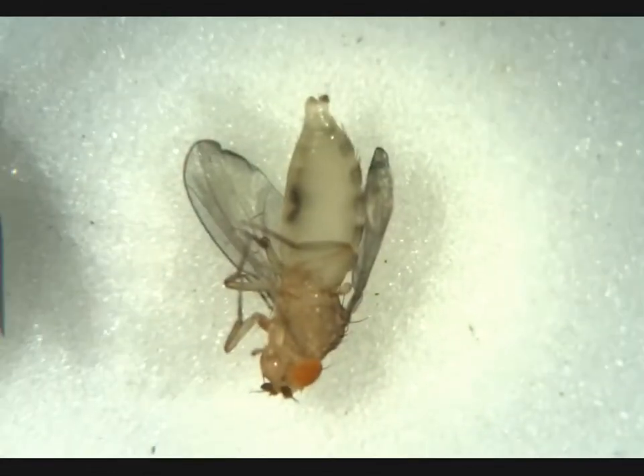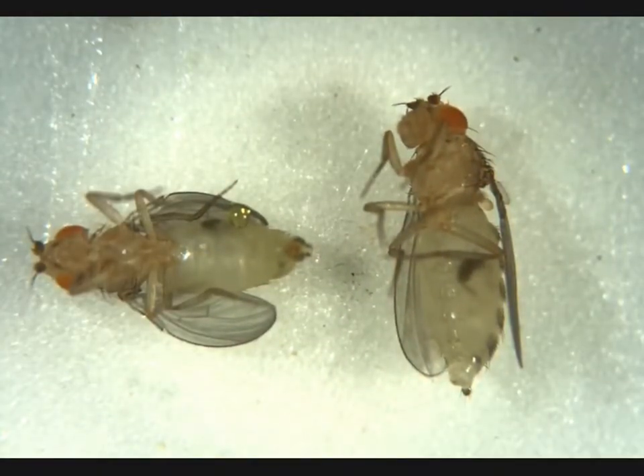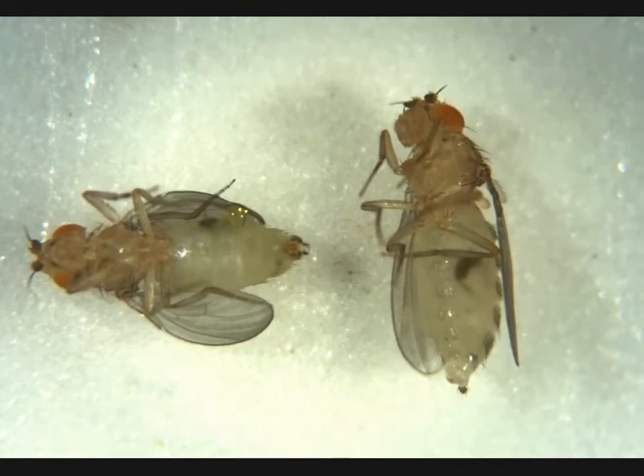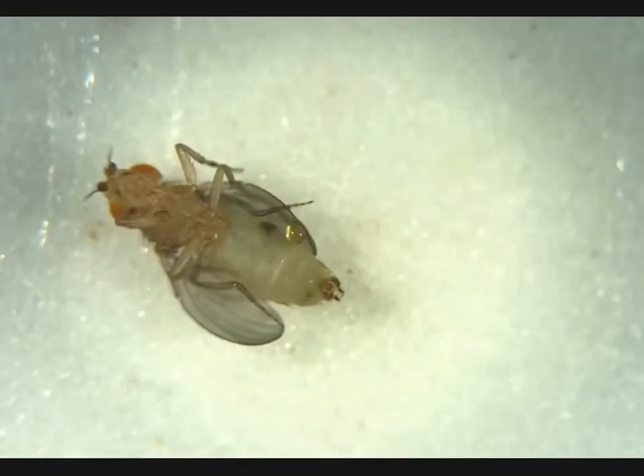And we have a virgin female here. We can tell — no penis apparatus, visible meconium. Another virgin female next to a virgin male. This is pretty exciting. We can see that the virgin male has a penis apparatus here, and we can also see no penis apparatus on this female. We can see a visible meconium on both of these flies — pretty exciting to see in juxtaposition. So we're going to go ahead and say virgin female here, virgin male here.